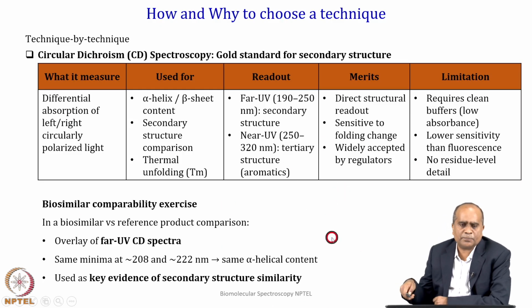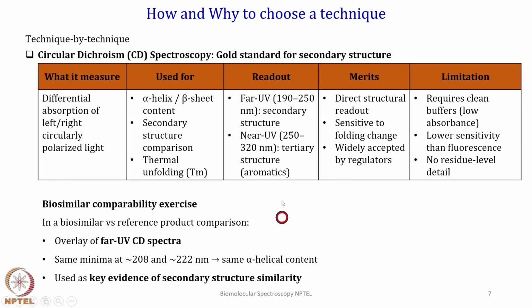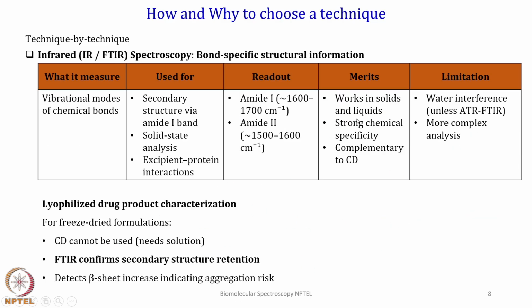In CD, if the spectra are overlapping, suppose here is my spectrum and you have a dotted line spectrum just overlapping on top of each other, this is RLD and your drug product, it says that my protein has the same secondary structure like the reference product, and that is a biosimilarity test one can have.